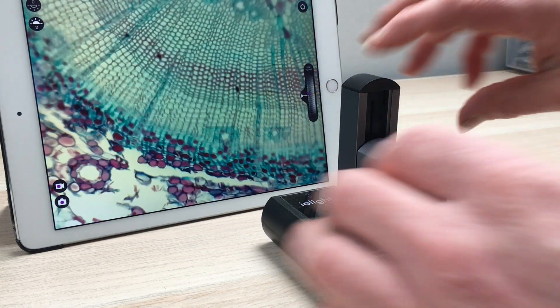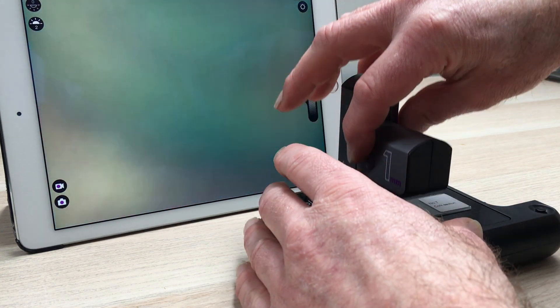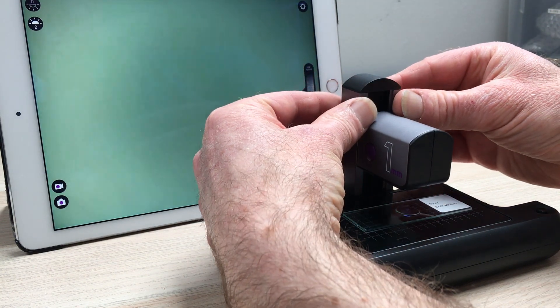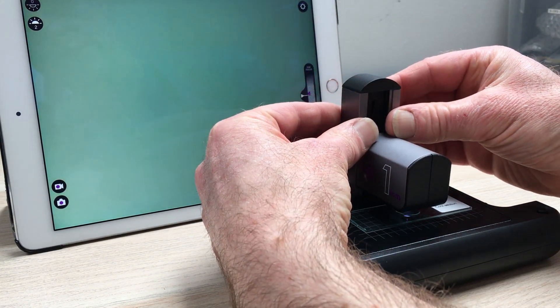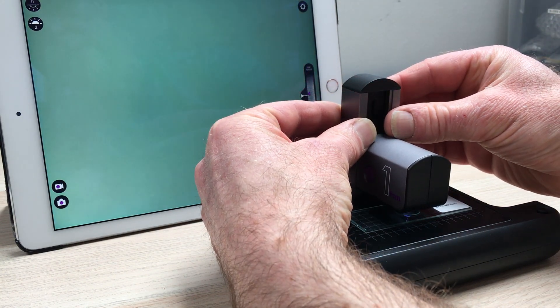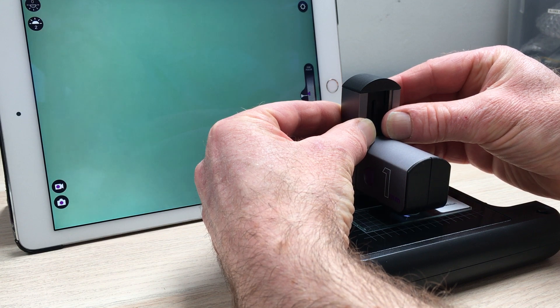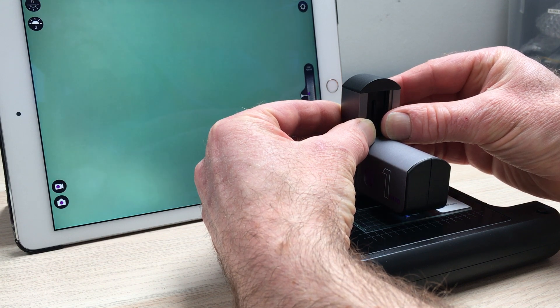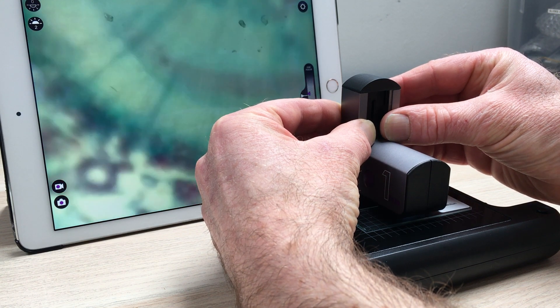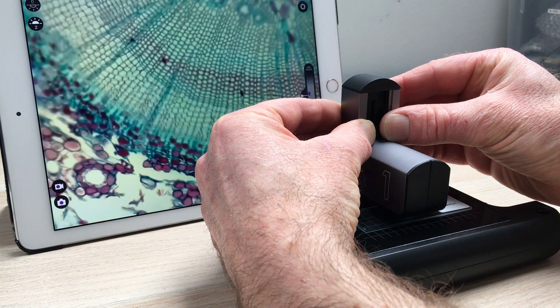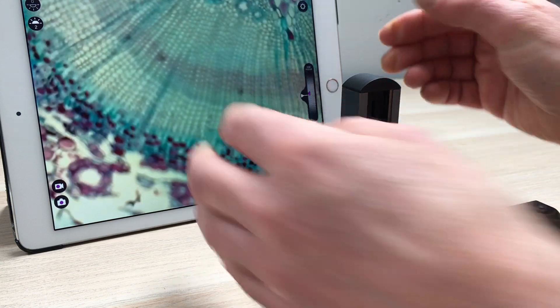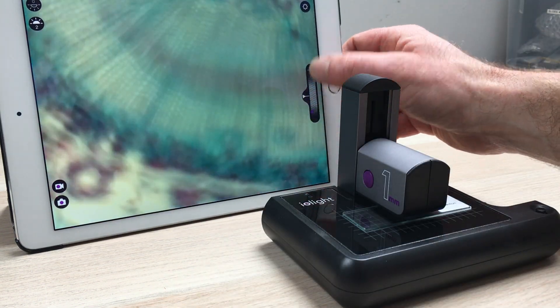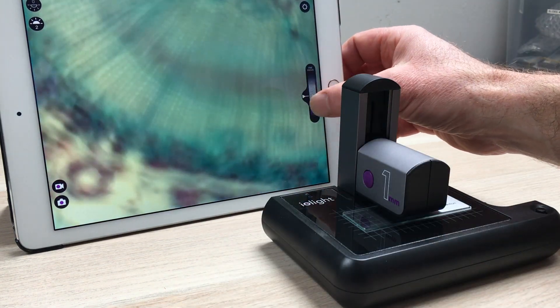Yet another method some people like is to use two hands to focus like this. So I'm just pushing it down with two hands until you start to see something in focus. And then you can focus that properly with the fine focus.